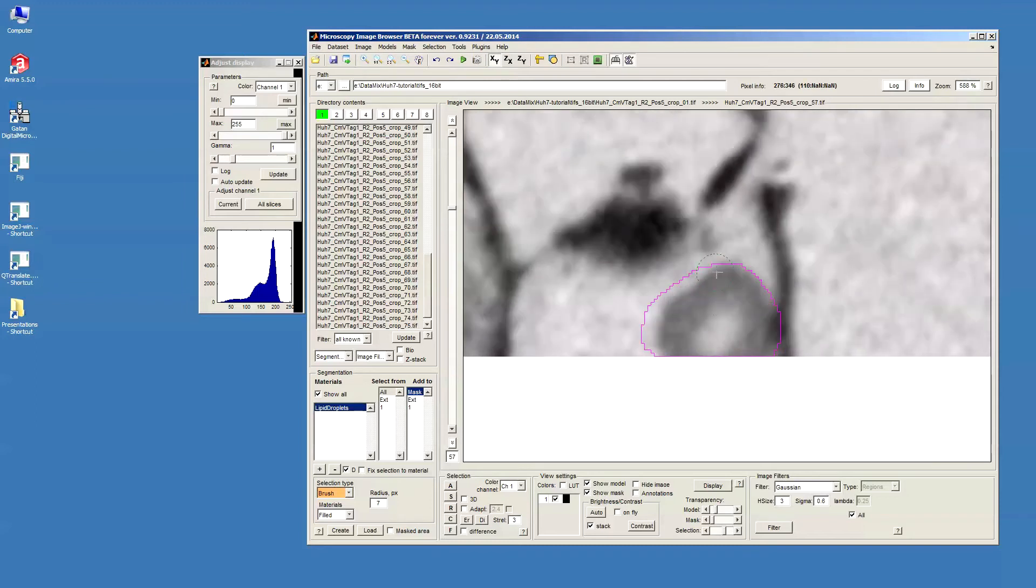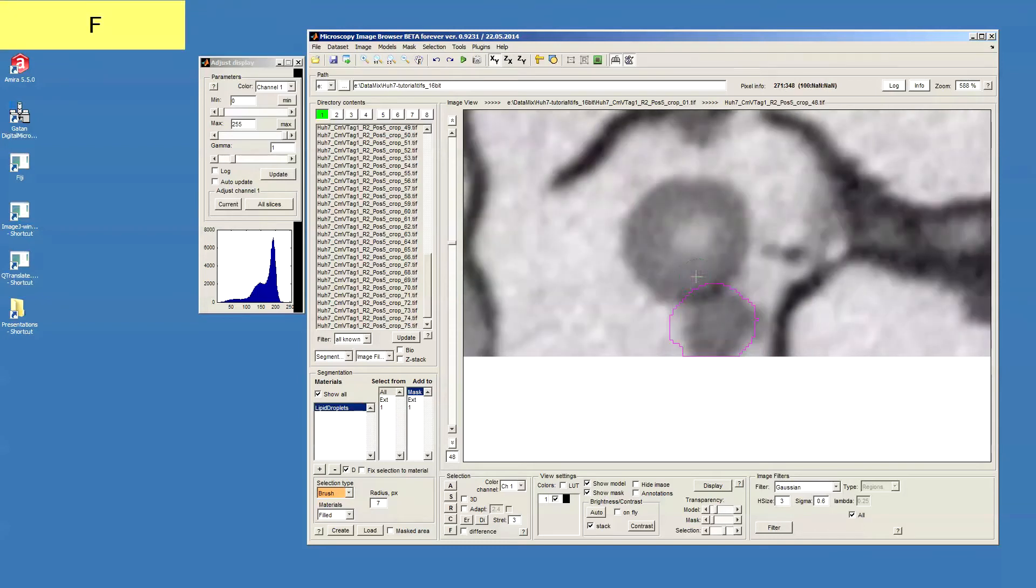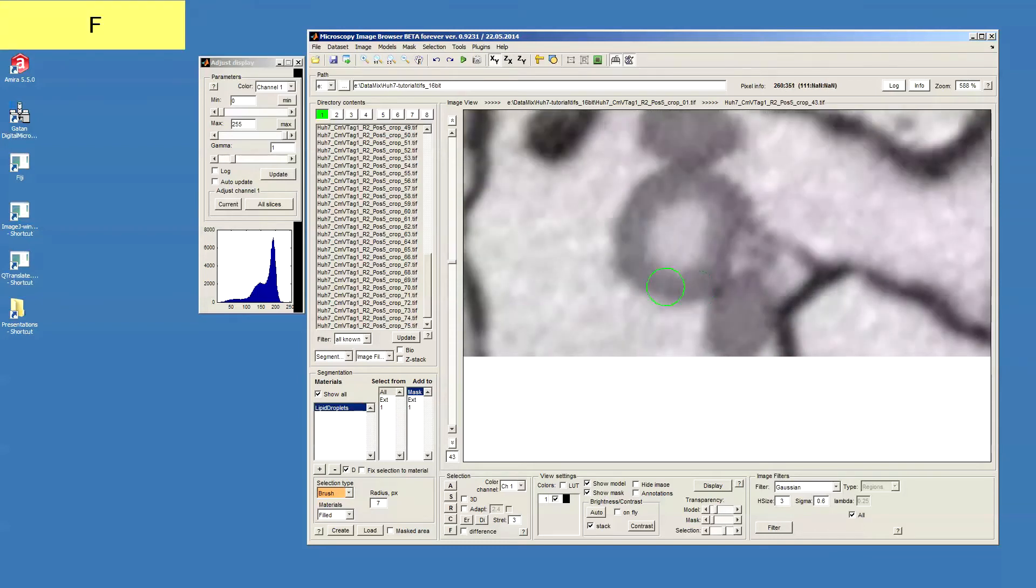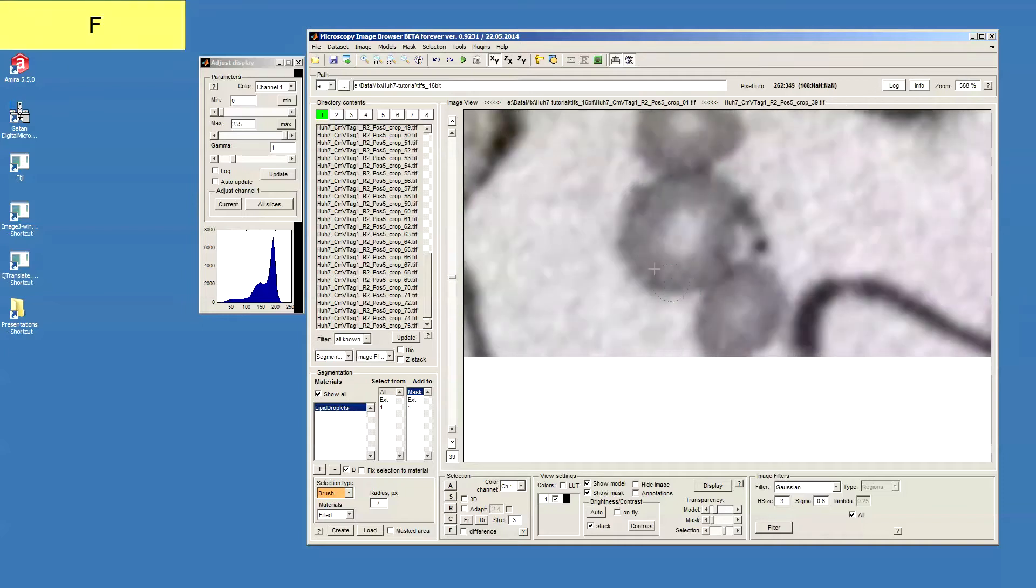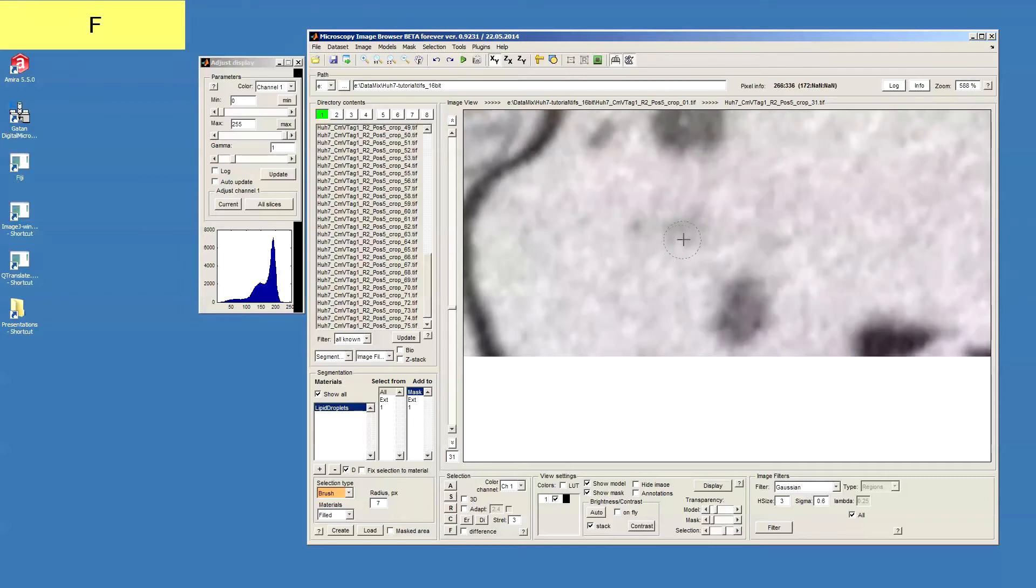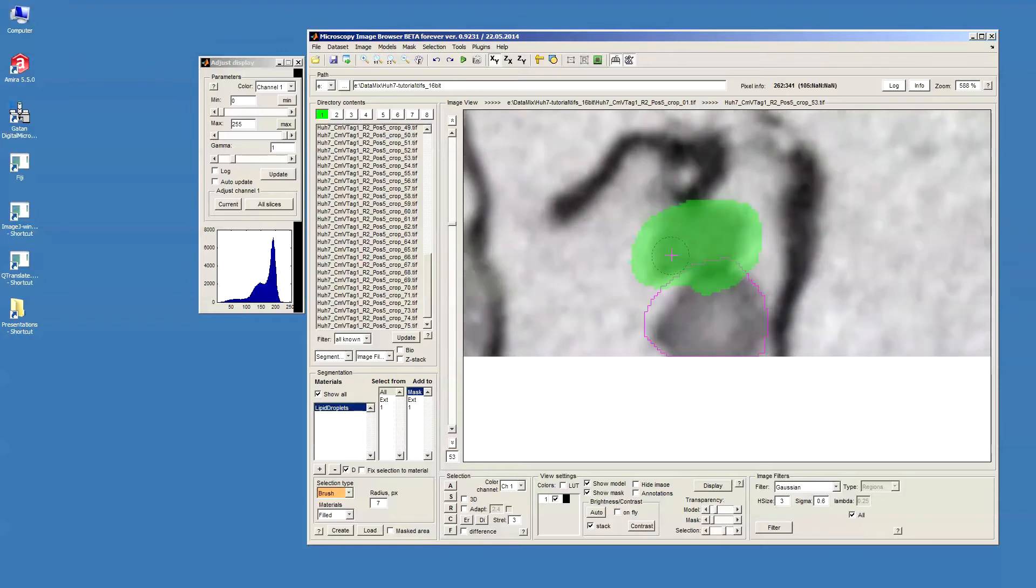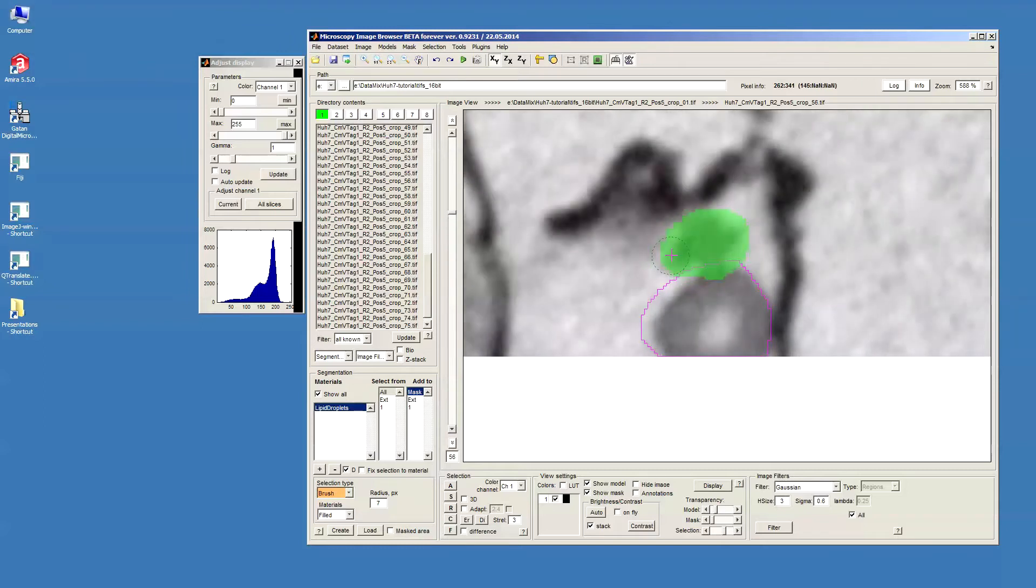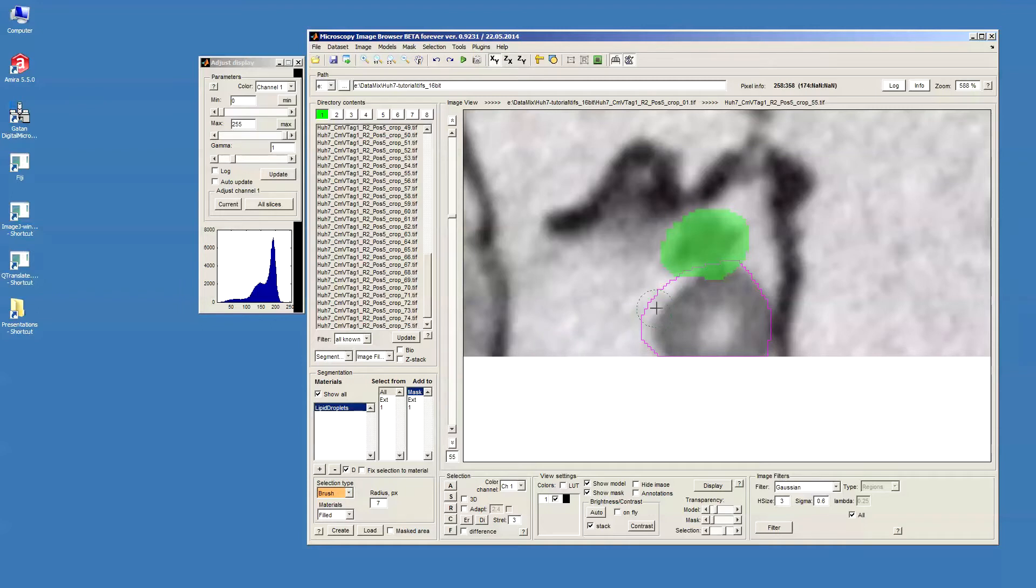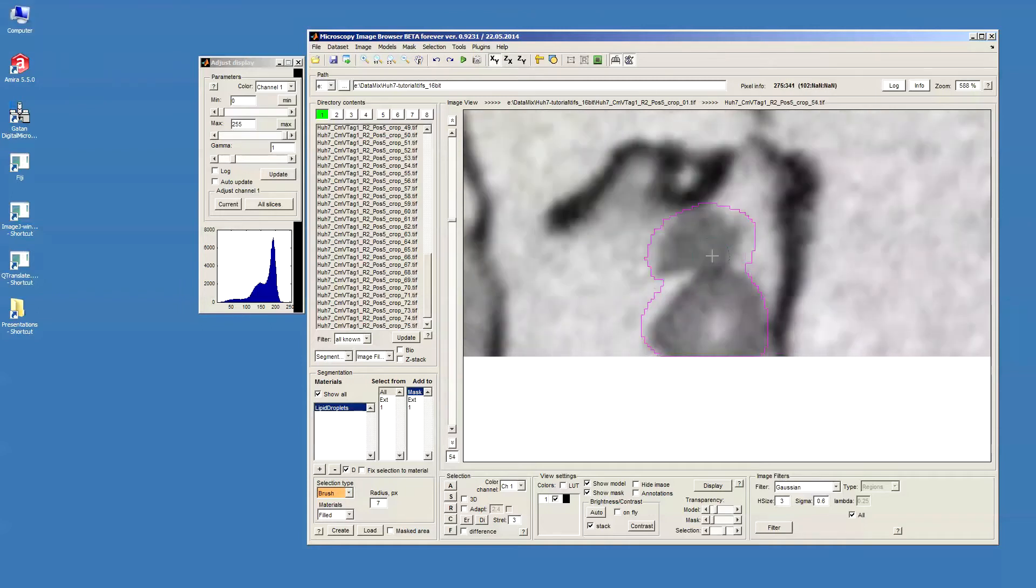Now I go to the next lipid droplet which is here. And again I'll do this kind of rough mask around it, just to really have the lipid droplet within this masked area. And then I press I to interpolate. Now I have another area selected and then I can again press Shift+A to add this selected area to the mask.